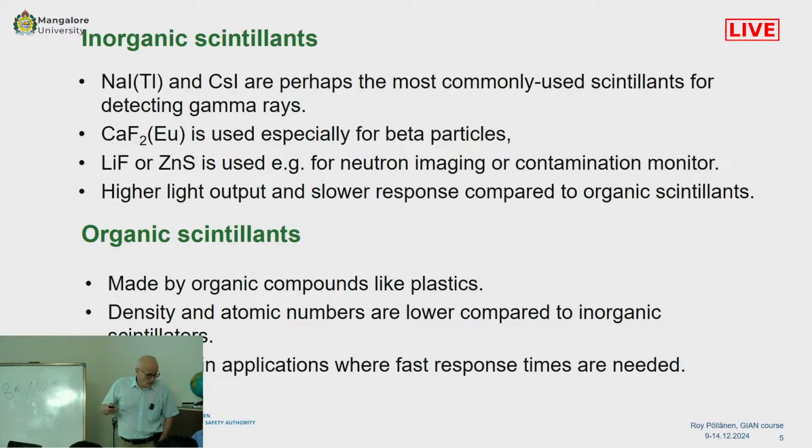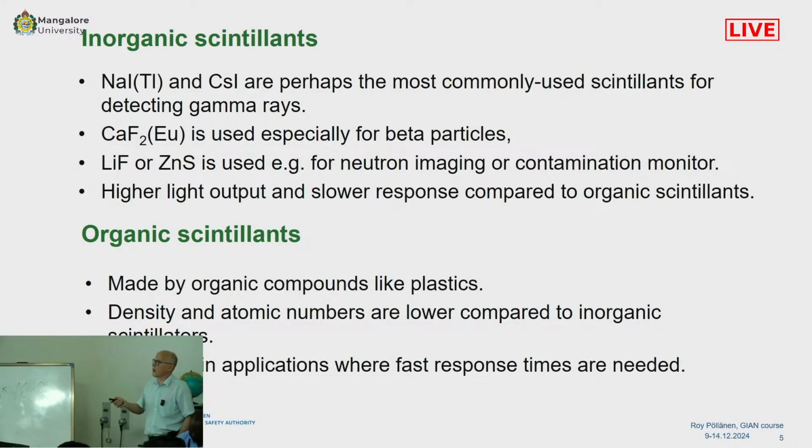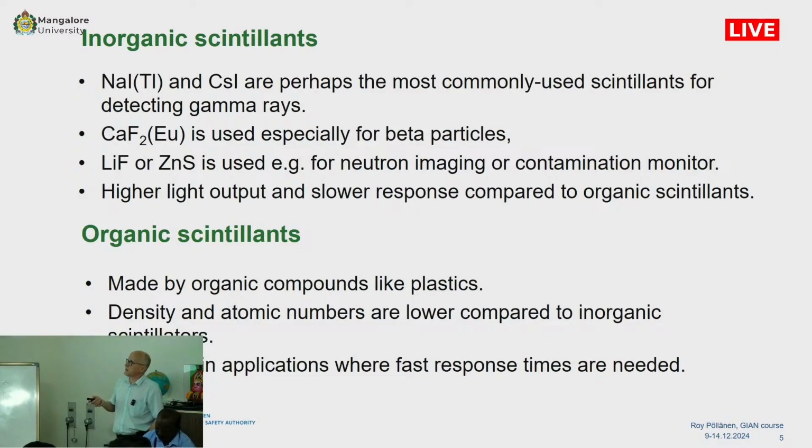So, regarding inorganic scintillants, perhaps the sodium iodide detector is the most commonly used scintillant for detecting gamma rays.